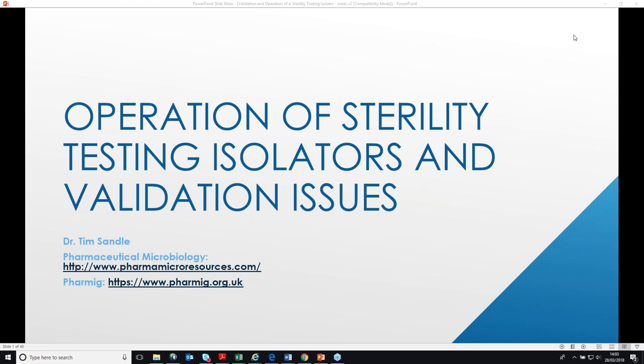So my name is Tim Sandle, and I'm a committee member from PharmIG. And today we're going to have a look at sterility testing isolators.